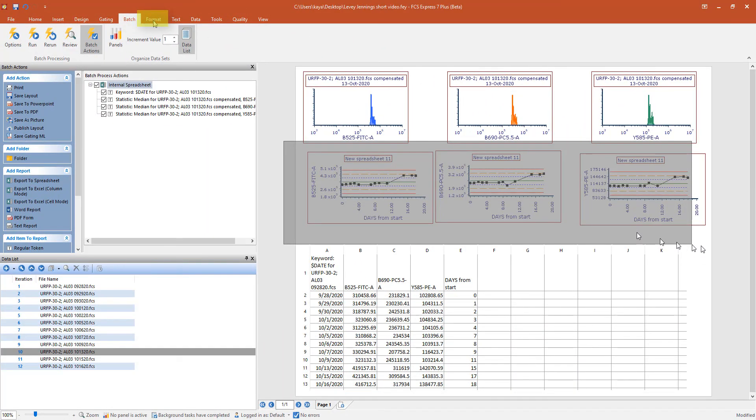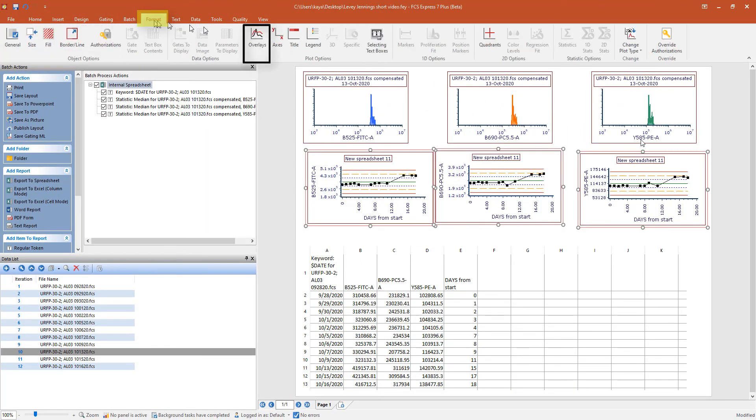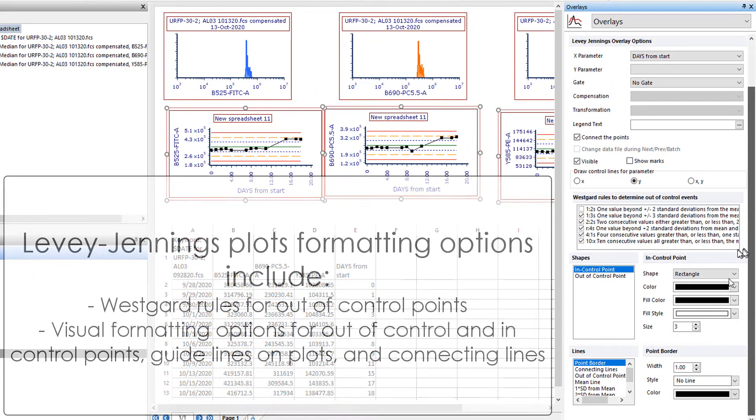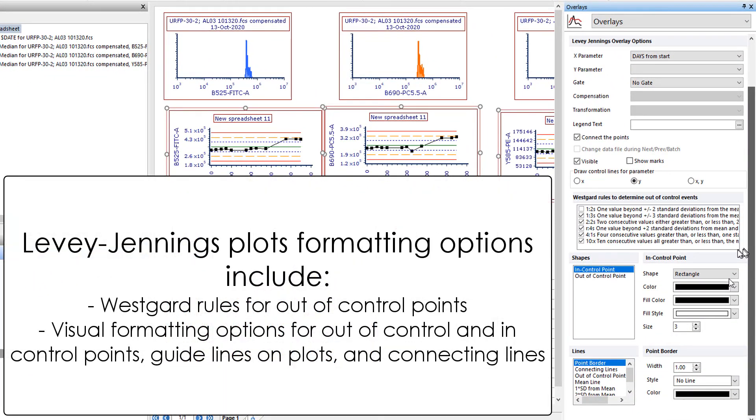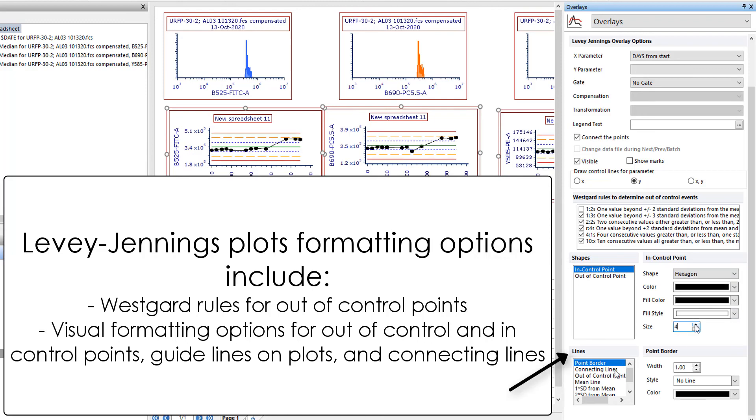Click Format Overlays to access various formatting options. These include, but are not limited to, the Westgard rules for determining out-of-control points, the shapes and colors for in-control versus out-of-control points, and lines on the Levey-Jennings plots, including those for the mean and 1, 2, and 3 standard deviations from the mean.